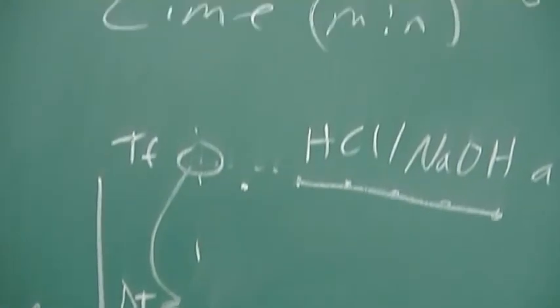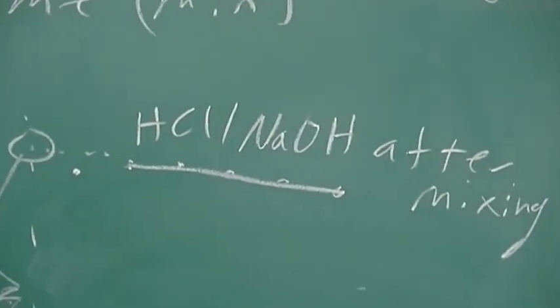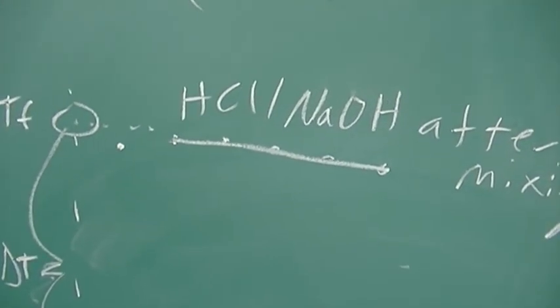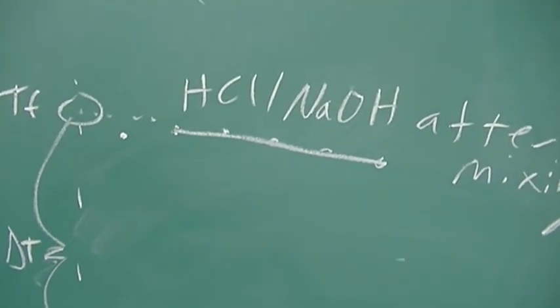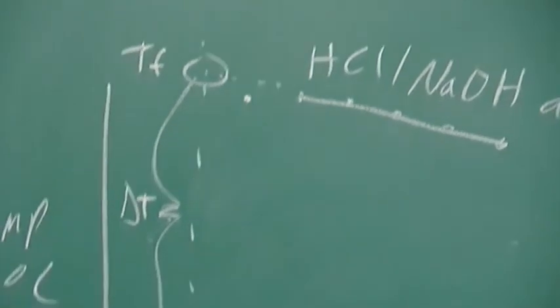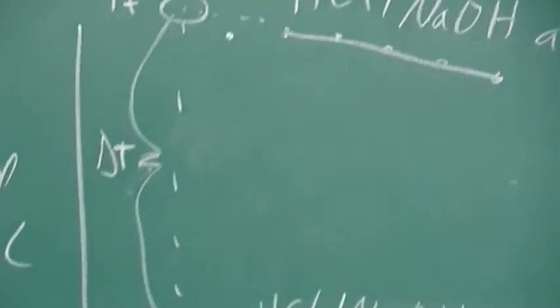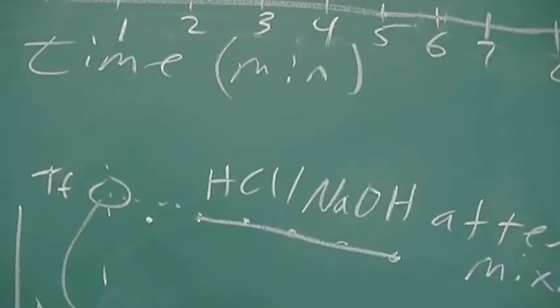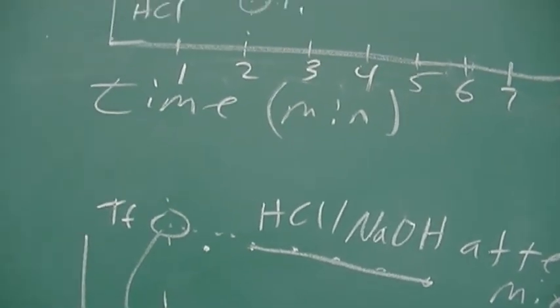After mixing, it was 24. This is showing a change in our temperatures, but apparently our calorimeter was very good and it just stayed straight across at 24. And so your temperature final is going to be 24. Now, in order to find it, you would have to extrapolate, but since we only have one number for initial and 24 every time for the final, it is 19 for initial, 24 for the final.